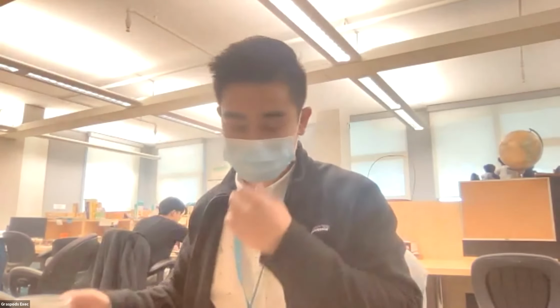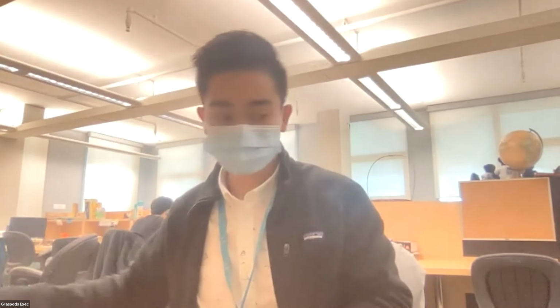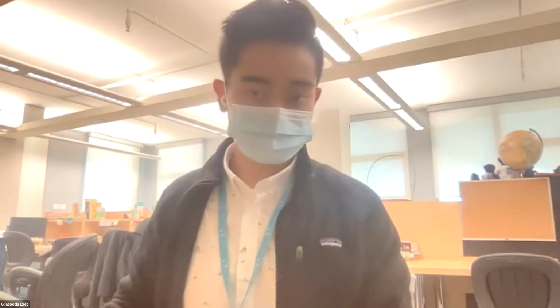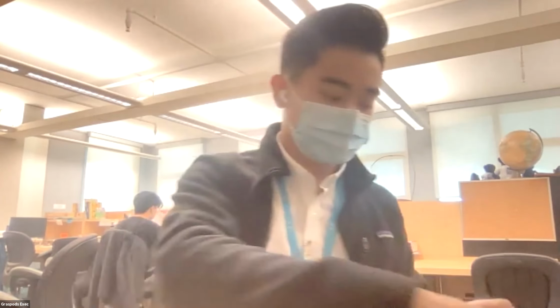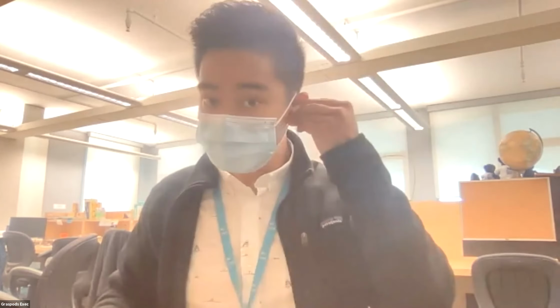Great, Nikita. Could you please briefly explain what happened in normalization? Whenever I do gene expression normalization, it reminds me of using housekeeping or reference genes and dividing the expression to get the normalization. But here I didn't see such a thing happening. So what was going on during normalization exactly?